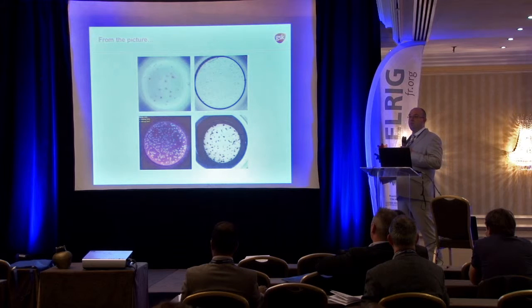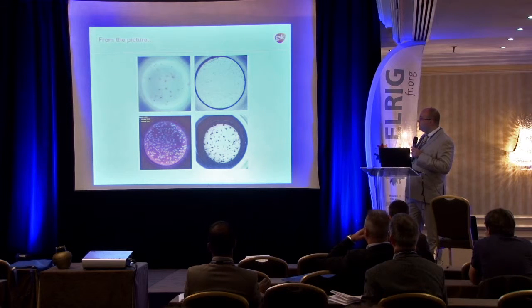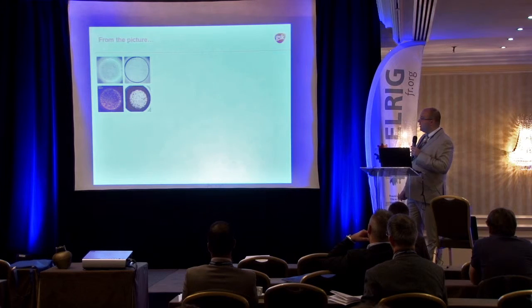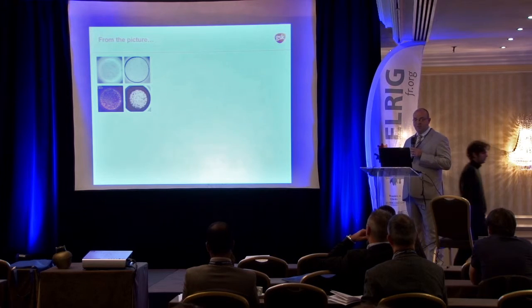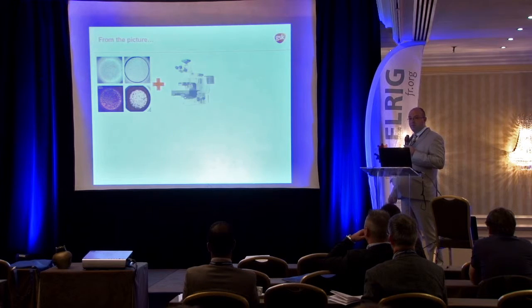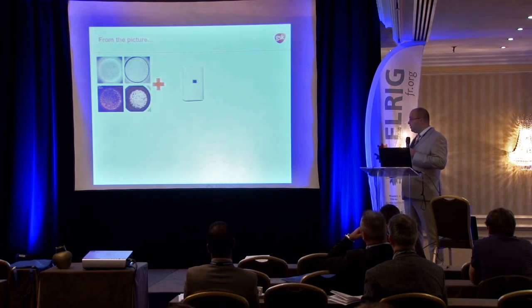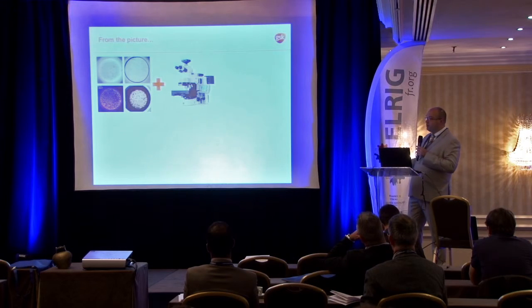But the next step will be, can you measure what I can see? What type of information do I need to take from the picture? So it will be a measurement or a counting, depending on the needs. And when you have given the service, every time it is the same: can you go further for me? Can you take the same picture of all my tests? So you have to automate the test. You have to choose the right acquisition setup, microscope or macroscopic.